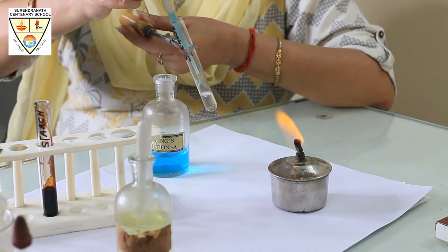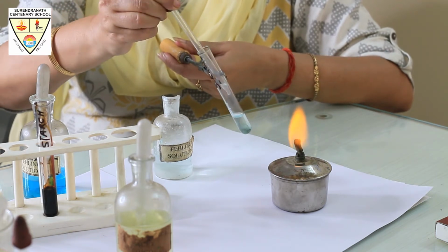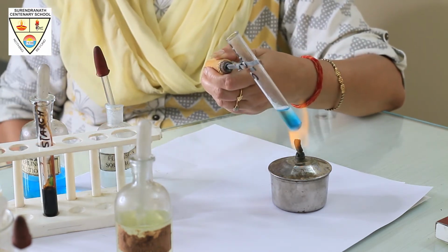We start with our experiments on glucose. With glucose, you can take 2 milliliter of fruit juice in a test tube, and to that we add equal amounts of Fehling solution A and Fehling solution B. Remember, it can be 5 drops of Fehling solution A and Fehling solution B, and then we boil it.